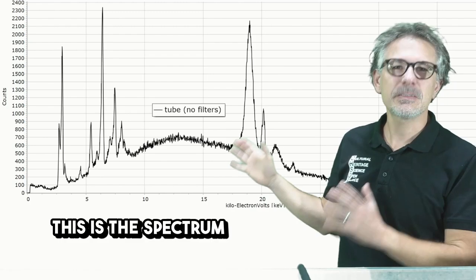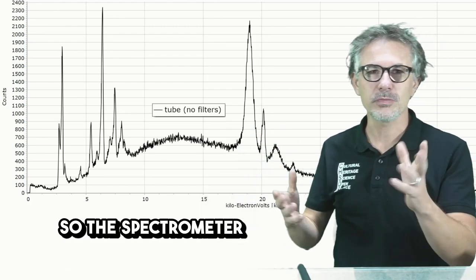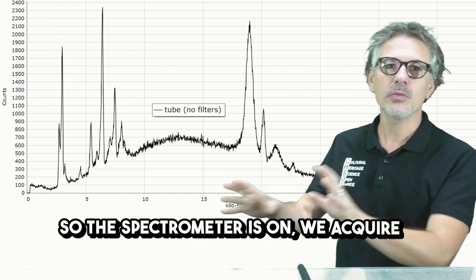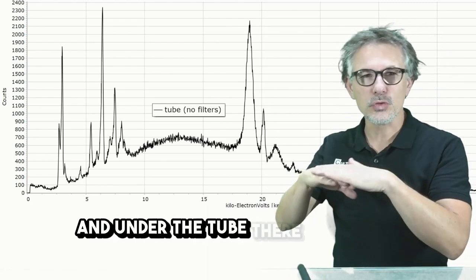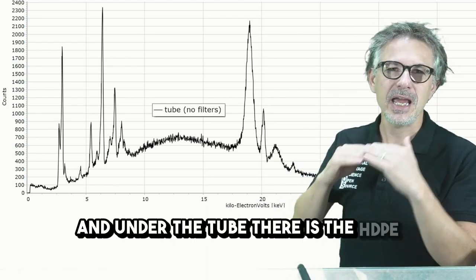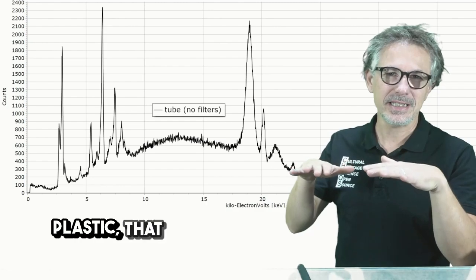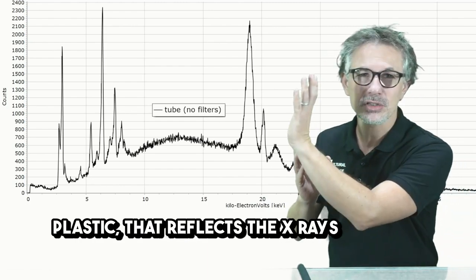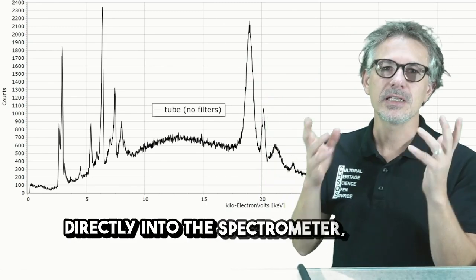This is the spectrum we acquired from the tube. So the spectrometer is on, we acquire a spectrum, and under the tube there is the HDPE material, plastic, that reflects the X-rays from the tube directly into the spectrometer.